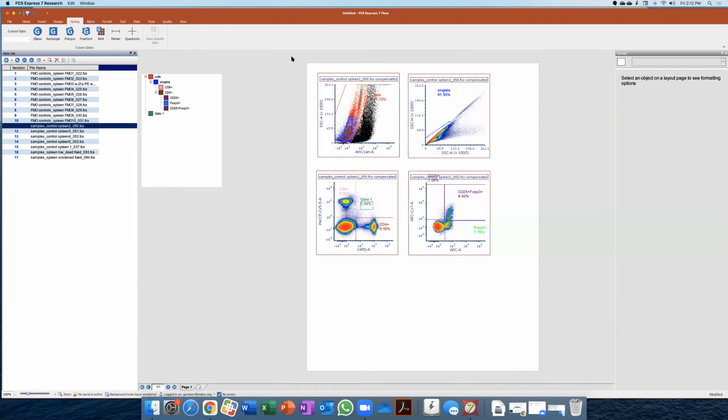But there are going to be markers expressing along a continuum that you're absolutely going to need an FMO for every single time. So at the onset of a panel, an FMO for each and every marker, and then moving forward, you might be able to pare it down a little based on how those populations resolve. Yeah, exactly, I would absolutely agree. And as Rui said earlier, you have to use your cells for the FMOs. So if you can knock a few of those out by looking at the pattern of expression, that's going to help you.